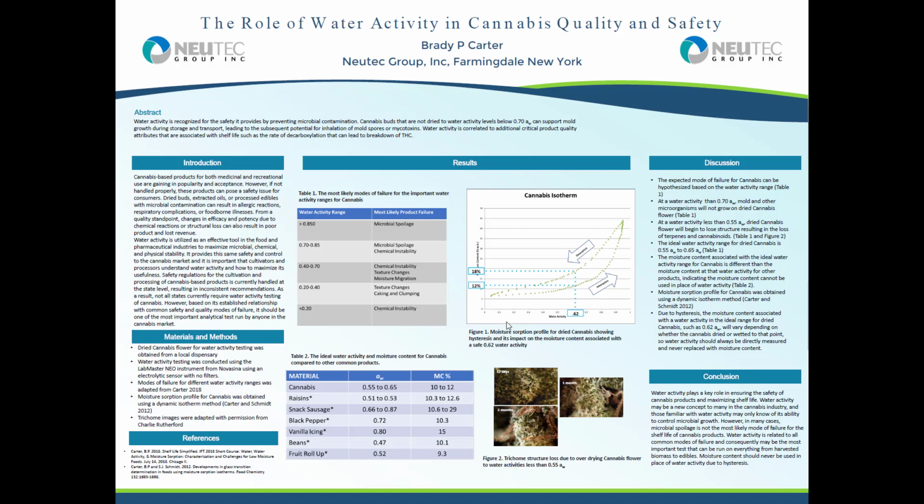And I want to thank you for your interest in my poster titled The Role of Water Activity in Cannabis Quality and Safety. The purpose of this poster was to provide additional information about why water activity is an important measurement in the cannabis industry.